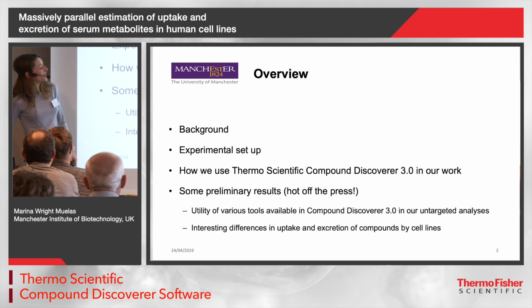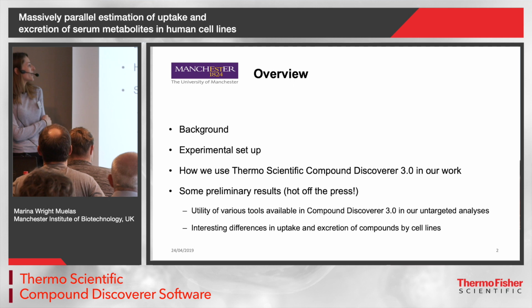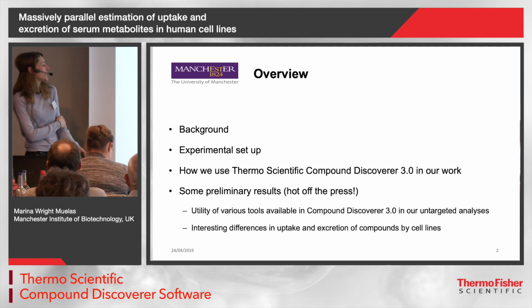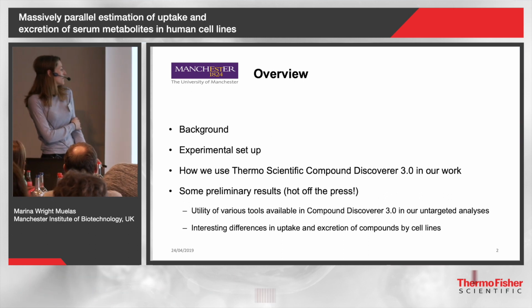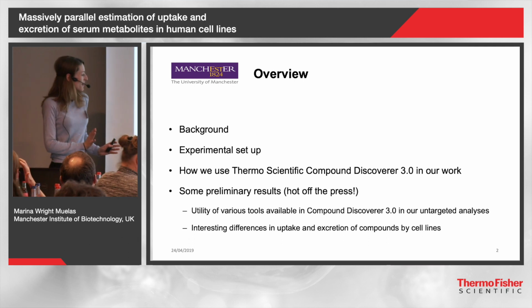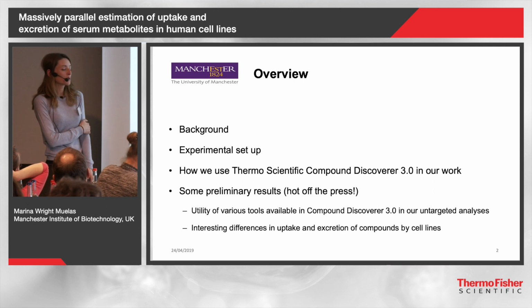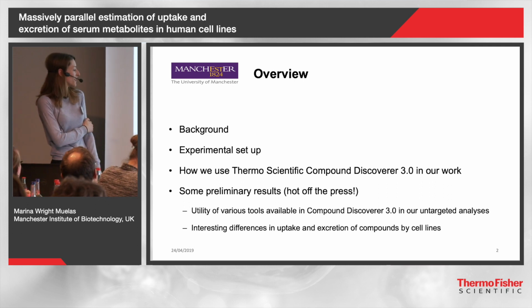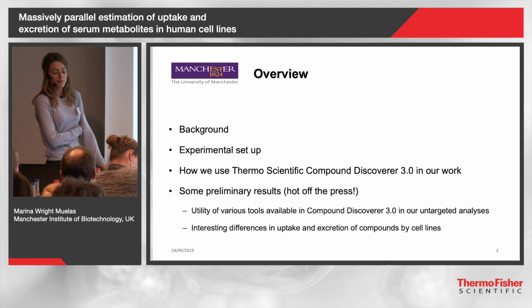So I'll just start off by giving you all a bit of a background on our project, going over how we set up our experiments and then how we use Compound Discoverer in our work. And then I'm going to show you a few preliminary results. They are hot off the press, so please bear with me, and how the utility of various tools in CD has helped us in our untargeted analysis, and especially the fact that we're already able to see interesting differences in the uptake and excretion of compounds by different cell lines.